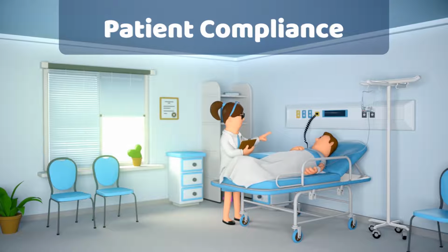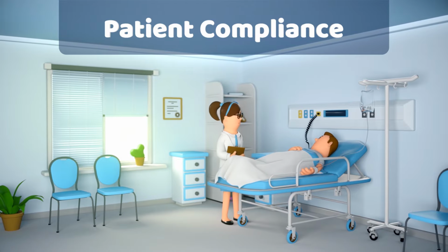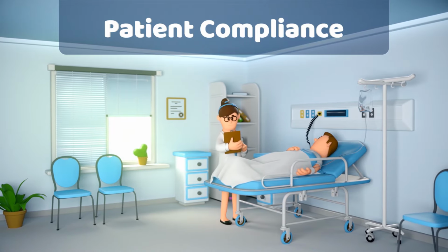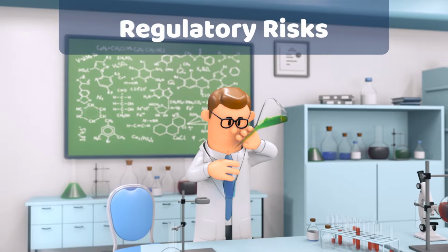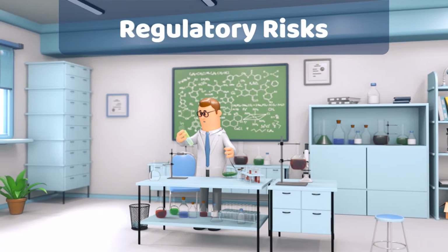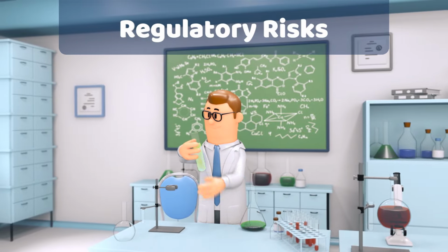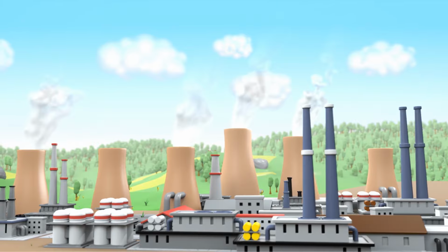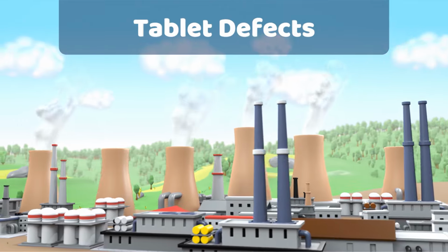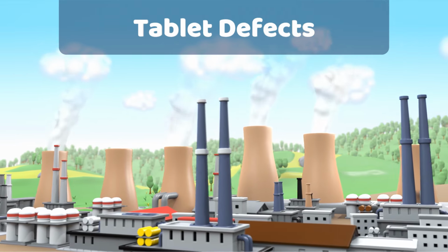Consistency is key when considering patient compliance. The correct dose and hardness must be met to achieve the correct dissolution and drug load intended for your product. When considering regulatory risks, tablets that fall outside of target specifications are rejected, delaying production and wasting product. Unexpected changes in tablet characteristics can cause many other tableting defects, such as capping, sticking, picking, and friability, leading to significant time spent on symptoms and not the root cause.